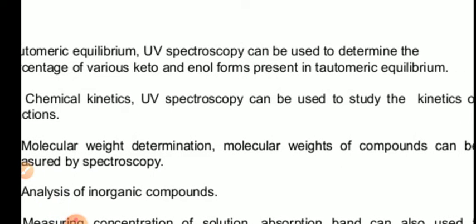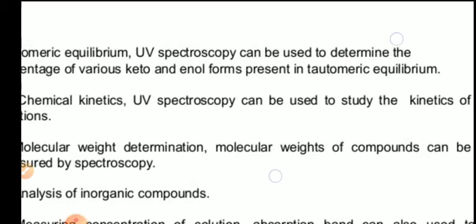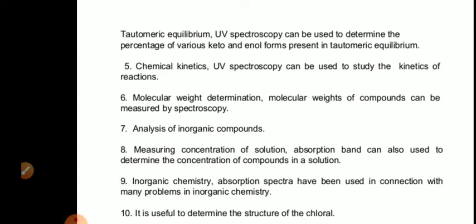We can also study various physico-chemical properties of a compound, like dissociation constant, association constants. The various physical phenomena like heat of formation of a molecular addition compound or complexes in a solution, determination of empirical formulas, hydration equilibria, association and dissociation constants of acids and bases, determination of intermediates can also be done with the help of UV visible spectrophotometric analysis.